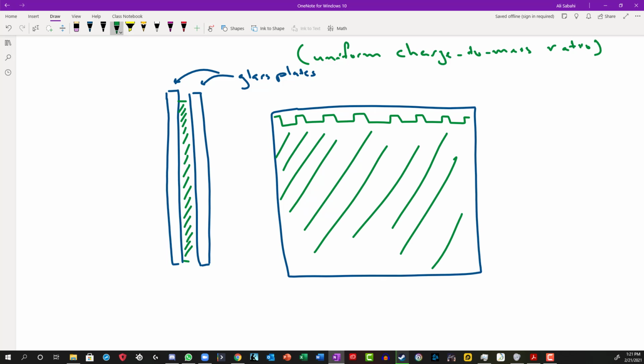Now, you might be asking, what are these indentations right here? The indentations on top, the ones being shown, like for example, here, right? These are wells, and these are the wells where you put your sample in. So you put your sample containing your protein into these wells using a pipetter.